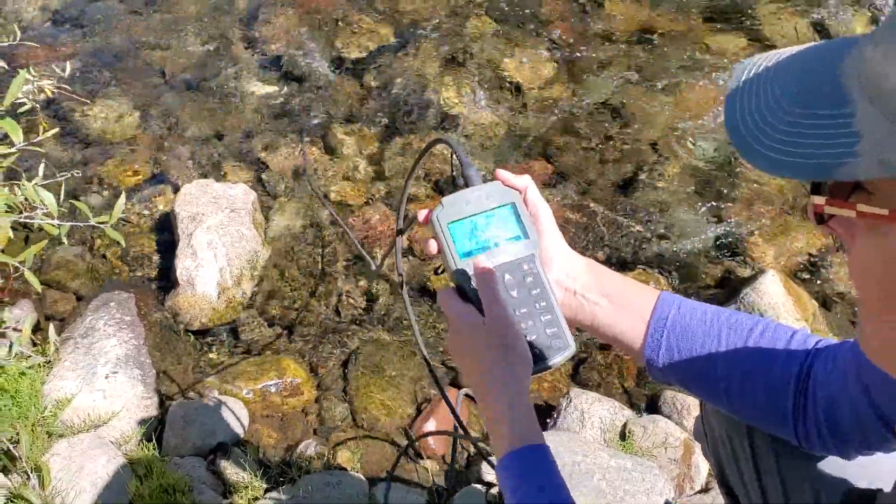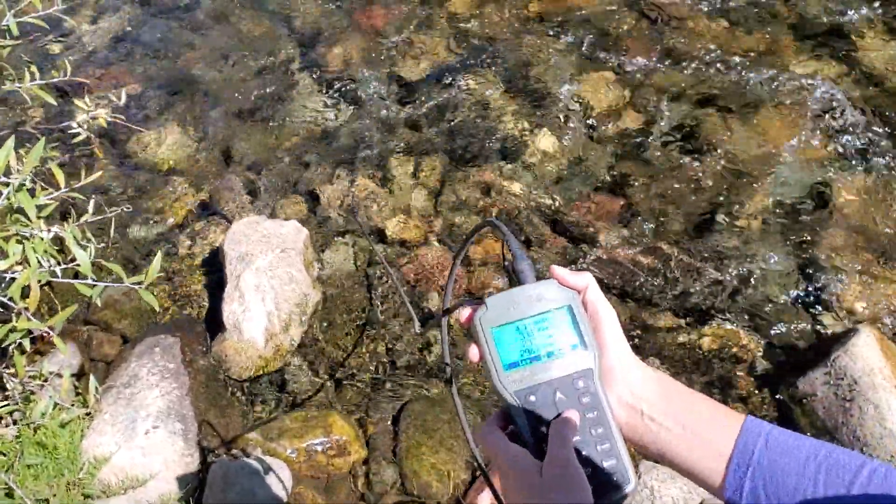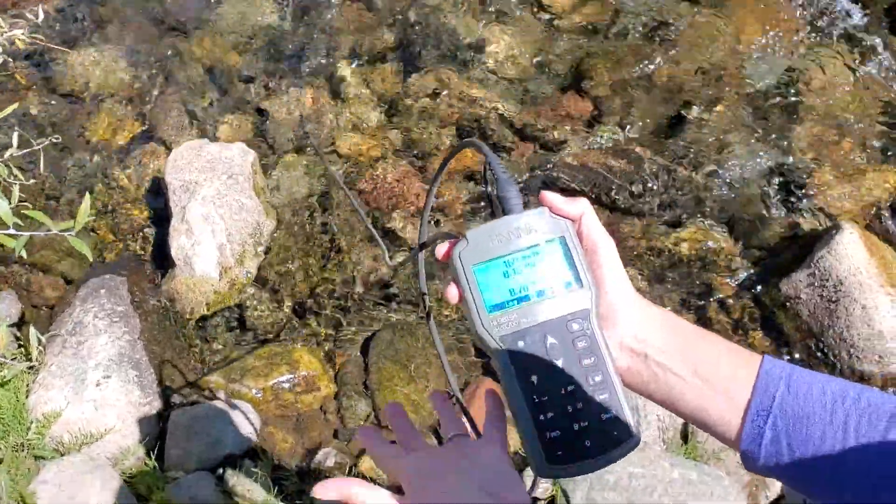And so we would just hit measure, and it would measure the parameters of our probe.